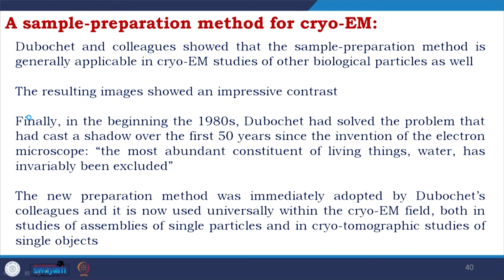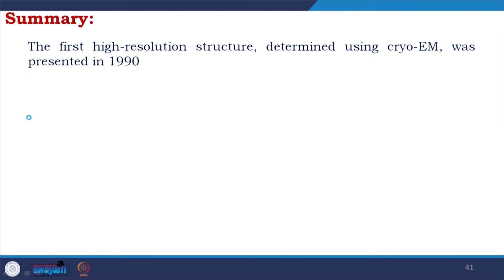The new preparation method was immediately adopted by Dubochet's colleagues and is now used universally within the cryo-EM field, both in studies of assemblies of single particles and in cryotomographic studies of single objects. So, that is all about the process details.